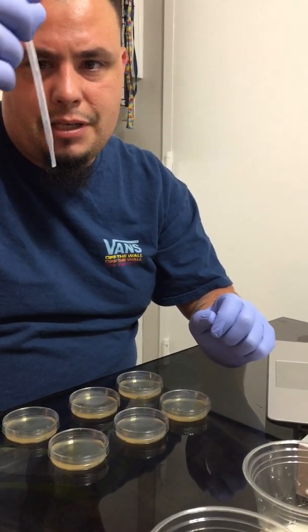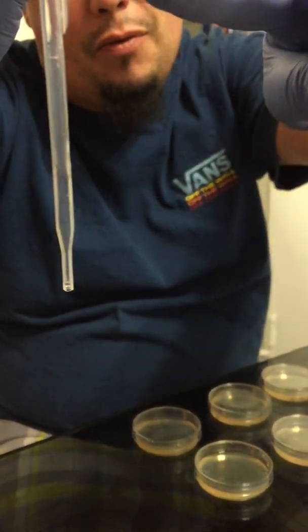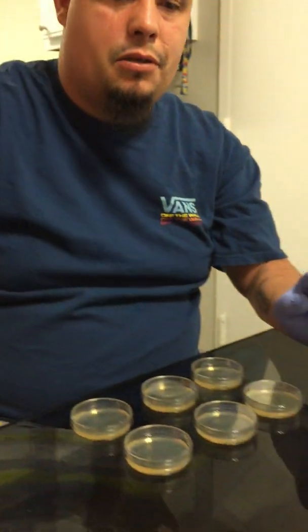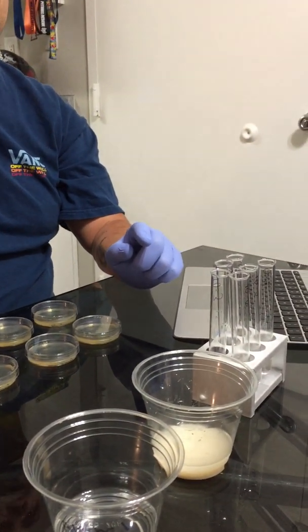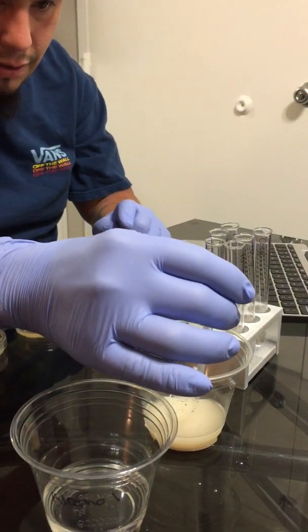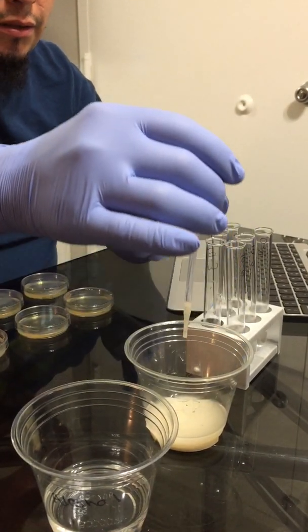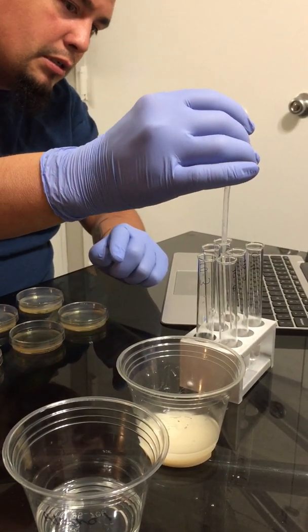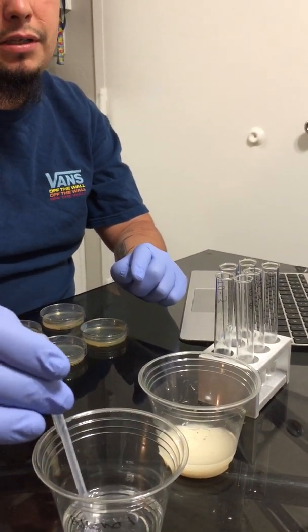I'm not sure if you can really see it on the camera, but it's labeled here, 0.25 mLs. We have the 1 ml, half ml, and there's 0.25 ml. So we're going to do the 0.25 mL here. So it's there. Then we're going to go into tube 1. Sterilize the pipette.